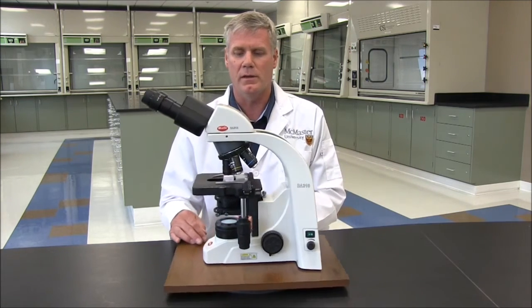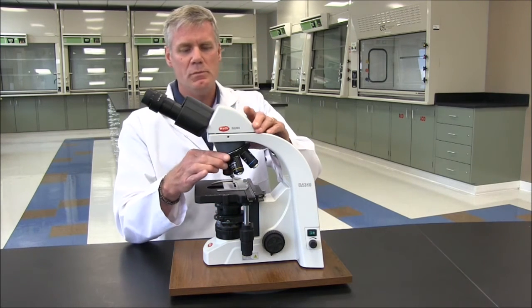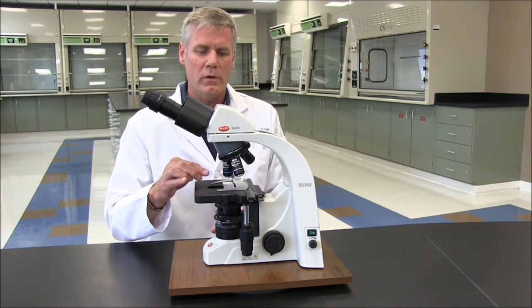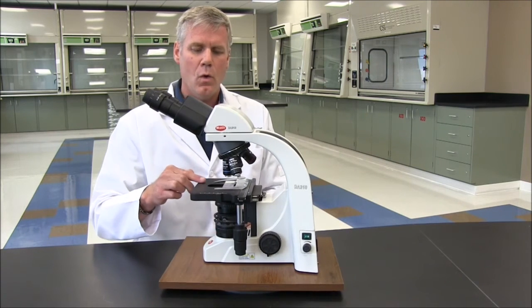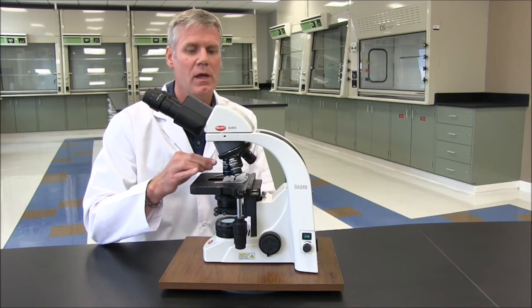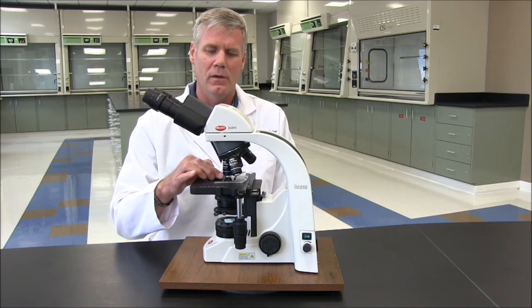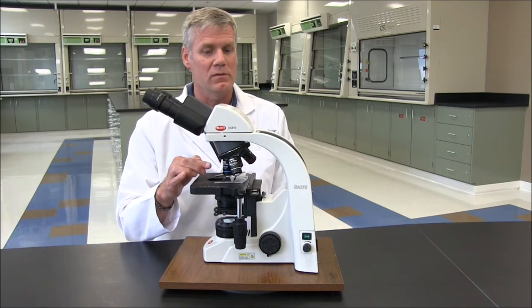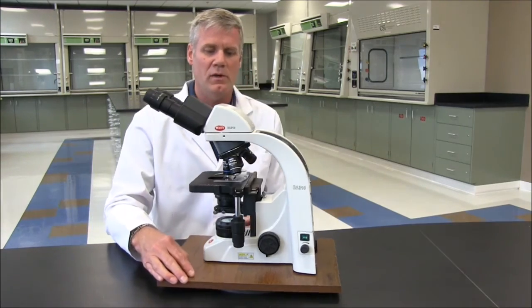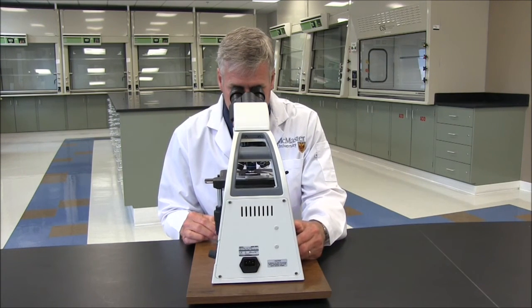When you're ready to view your slide, start by lowering the stage using the coarse adjustment to the lower limit. Use the revolving nose piece to rotate the objective that you want into place. In this case, we use the 40 times objective. While you're looking at the objective and the slide, raise the stage so that the glass slide is as close as possible to the objective, but not touching it. You want to do that while you're looking at it here and not through the eyepieces because you won't be able to tell how close the slide is getting to the objective, and you could end up cracking the slide or worse, scratching the lens on the objective. Once you have the slide as close as possible, you can look down the eyepieces and lower the stage until the specimen comes into focus.